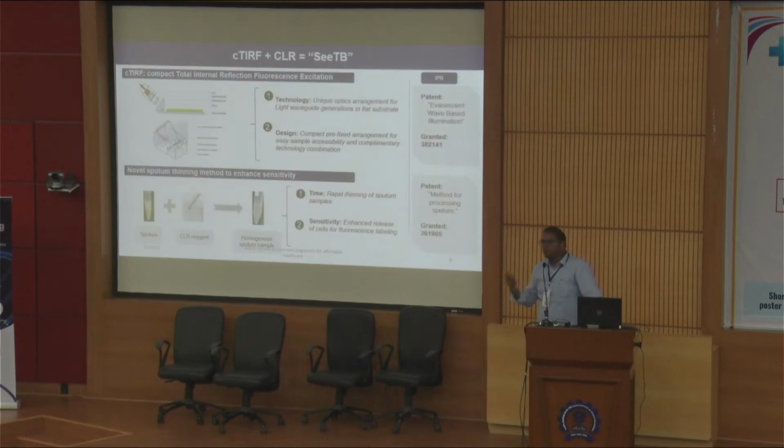Now, when we wanted to use this on clinical samples, I think Anidam was giving us this information, that at multiple stages you learn what the next challenge could be. So the sputum is a very thick sample. It is inhomogeneous. Everybody taking out a sample will get a different part. It can cause variability in the assay. So we developed another solution for liquefaction of the sputum, so you can thin it down and release the bacteria that are trapped in the nets of DNA and other things. So we now have two systems.